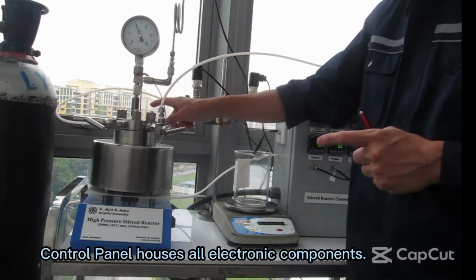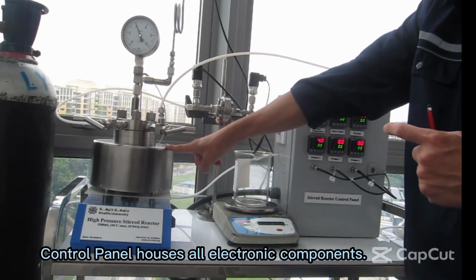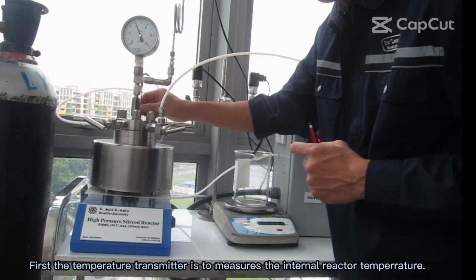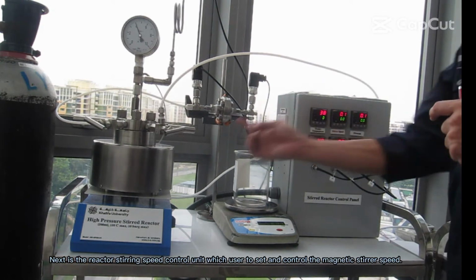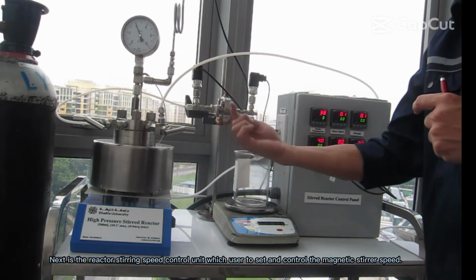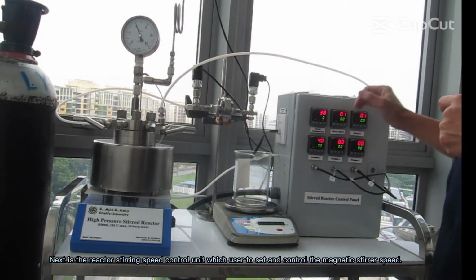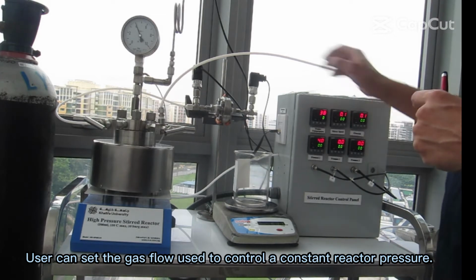The control panel houses all electronic components. First, the temperature transmitter is to measure the internal reactor temperature. Next is the reactor stirring speed control unit, which the user uses to set and control the magnetic stir speed. User can set the gas flow used to control a constant reactor pressure.